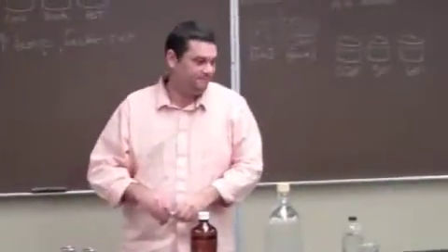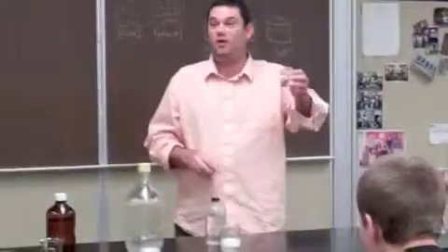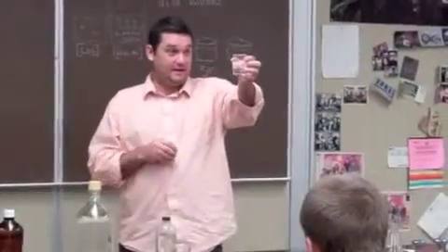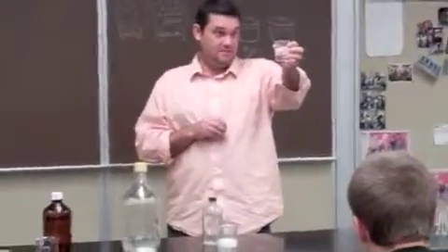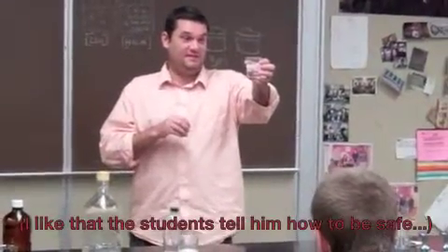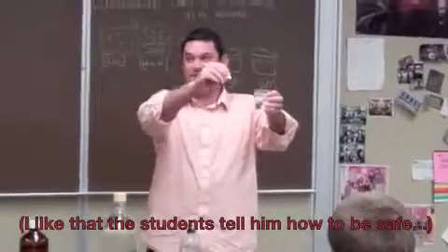All right, 12. I'm scared of this guy. 12 molar. Should we put it down? Can anybody see it smoking up front? Yeah, I can. Oh yeah, it's smoking. Put it on the table. It's giving off stuff. Ready?